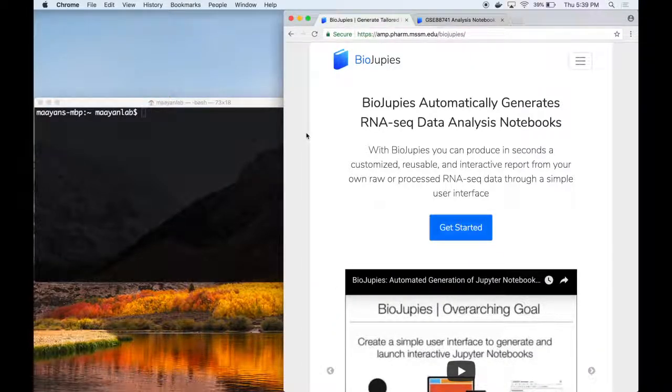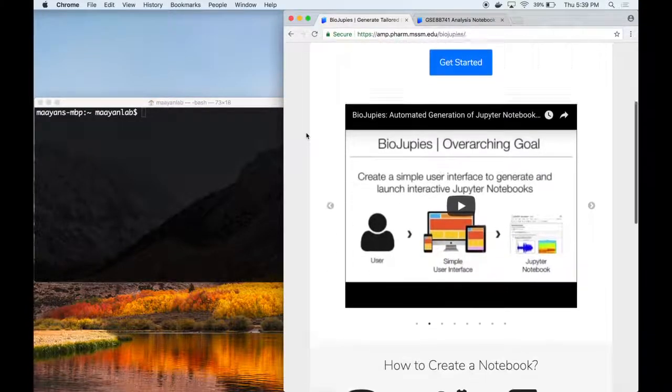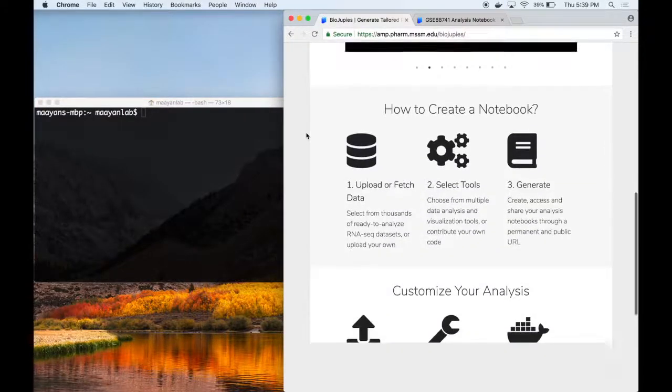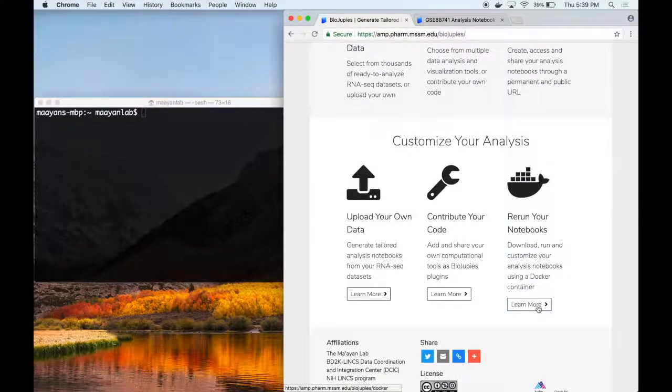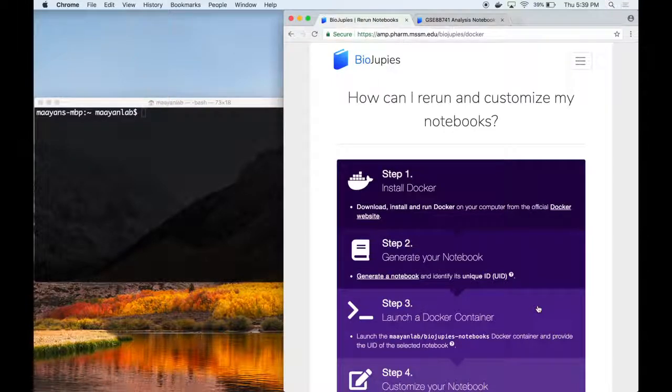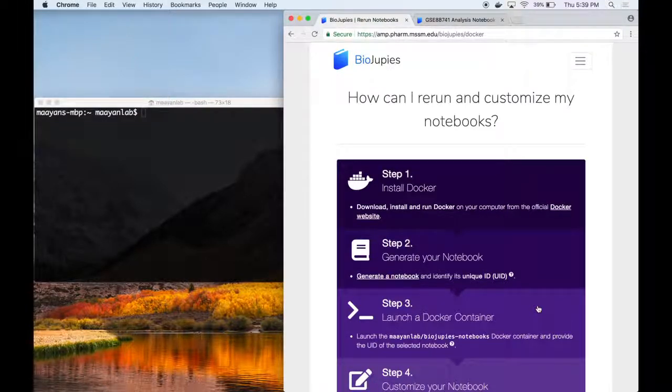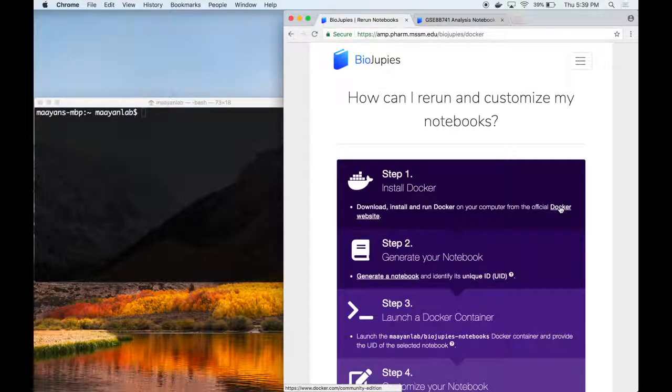A step-by-step tutorial on rerunning notebooks is available on the BioJupees website at the slash docker endpoint, as shown here. First of all, you are required to have installed Docker on your local computer. To install Docker, you can visit the link to the Docker website provided in the first step of the tutorial.